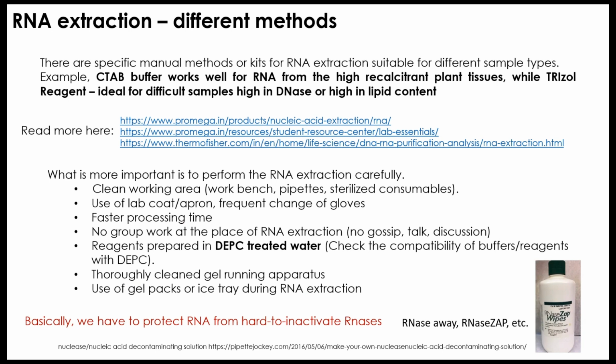So for different tissues, you have different RNA extraction methods, and even within RNA, if you're focusing only on small RNA or on certain types of RNA, then the kit varies. So you have to look into different company websites and decide which RNA extraction method researchers across the globe have been using and are more successful with, right?